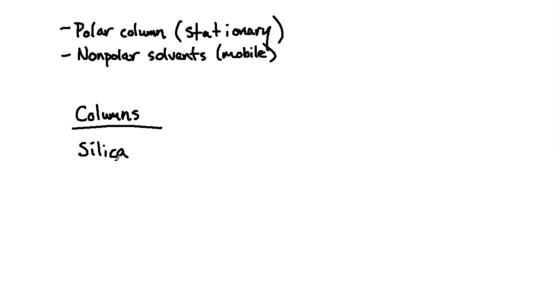So this is similar to many large-scale benchtop columns that are used for large-scale purification in laboratory practices. I remember back when I was in graduate school, I was doing organic chemistry, right? You would produce your synthesis, or create your new compound, and then there would usually be side products or leftover starting material if it wasn't completely efficient in conversion, and you had to separate the materials out to purify your bulk product to take it to the next step in the synthetic process.